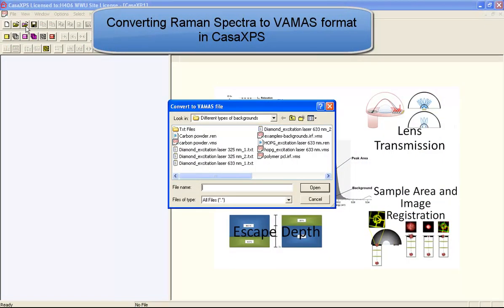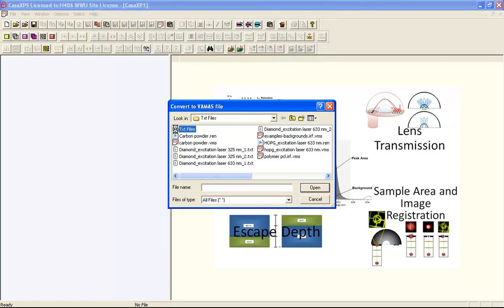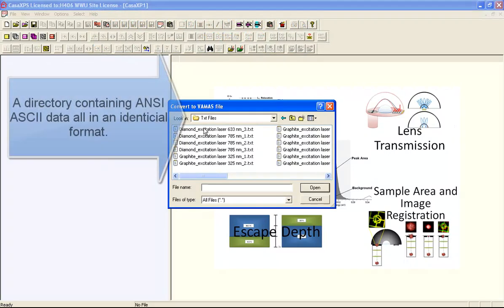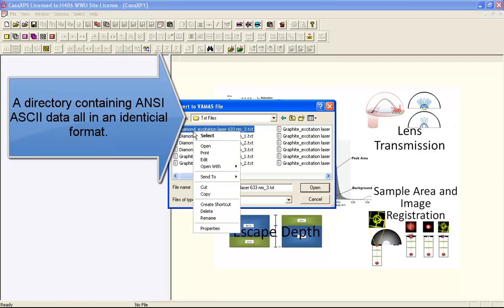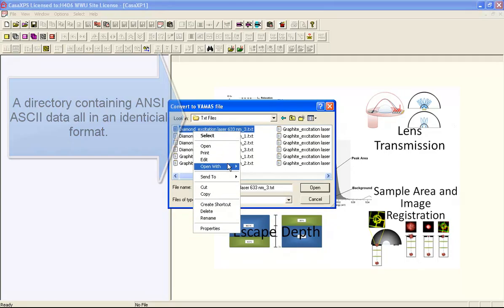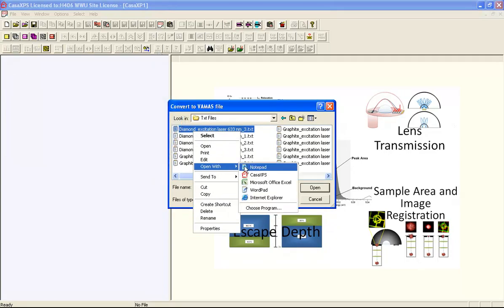When Raman data are collected into individual files, these files in an ASCII format need to be collected into a directory containing files all of a similar format.